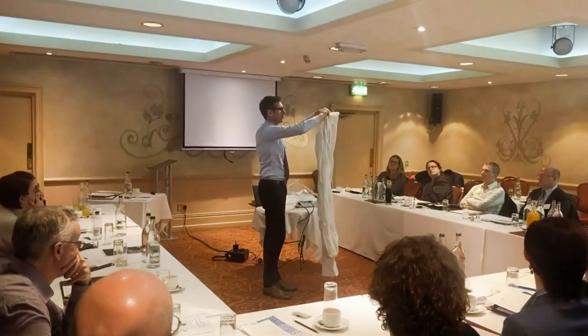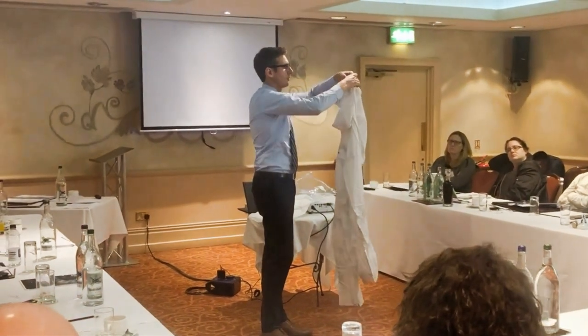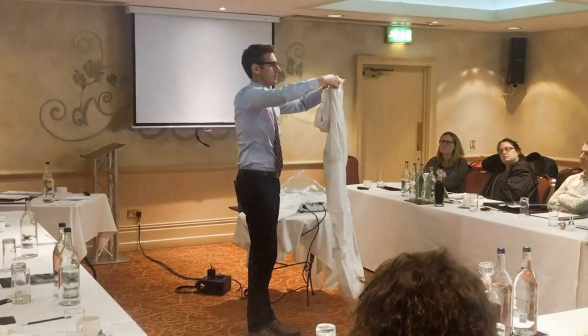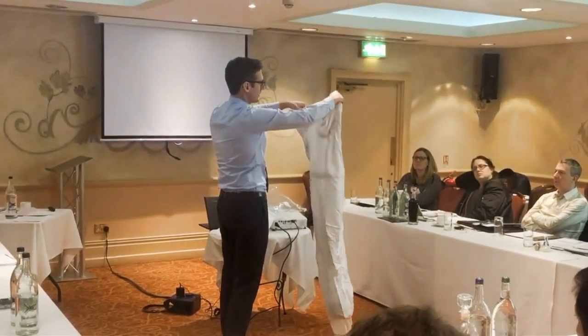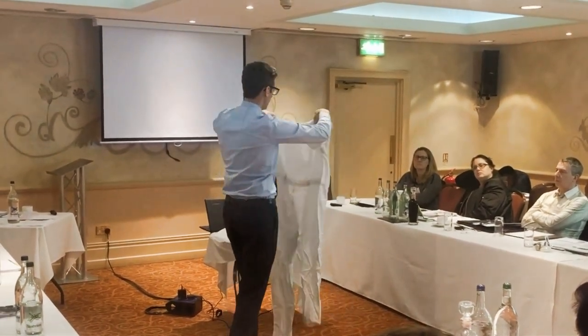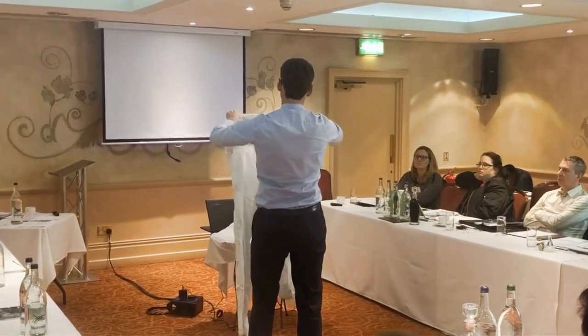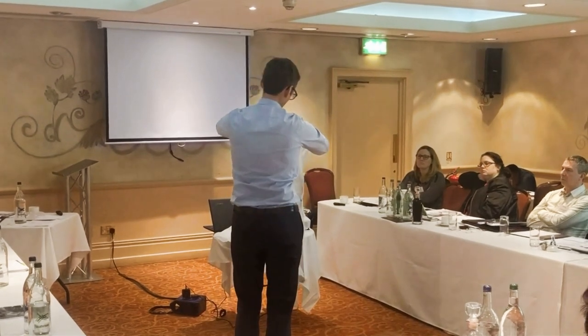Putting the first arm through the collar and continue rolling. Same with the second sleeve. And I of course need sterile gloves for that technique, because indirectly I'm touching the outside of the overall. I roll it like this until I reach the height of the belt.